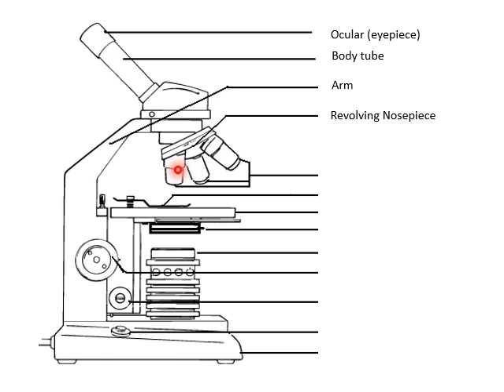Now, like I just said, these are the objective lenses. So these also have a lens in them, which are also going to magnify. The low power one is 4 times, medium is 10, and high is 40 times. So we can get our images quite enlarged, or our specimen quite enlarged, to look at it underneath the microscope. All right, so those are objective lenses. Now, some of the microscopes have this little clip on here. Some of them don't.